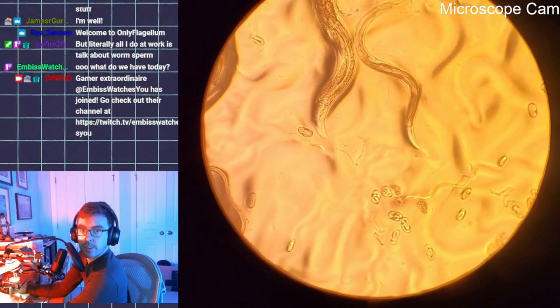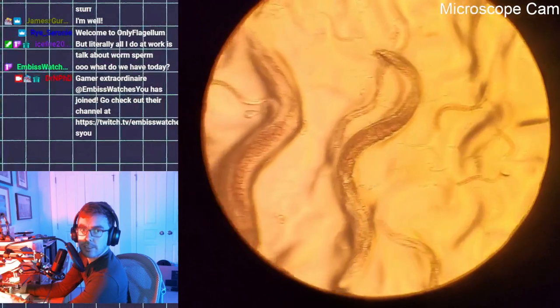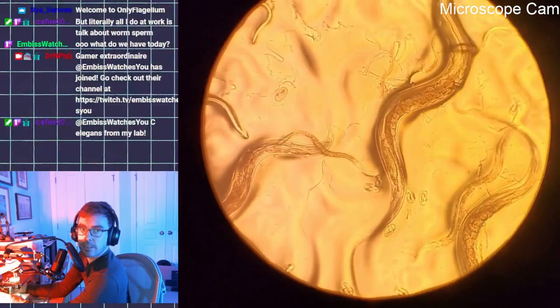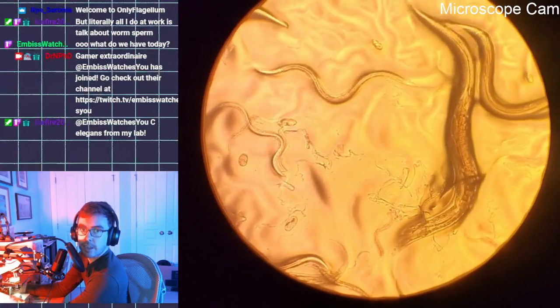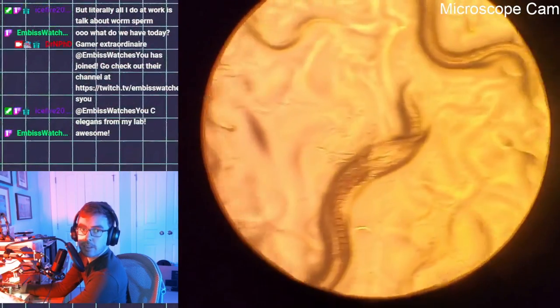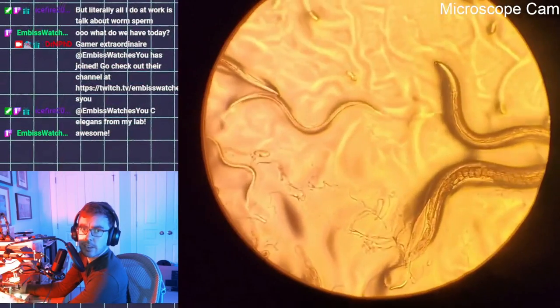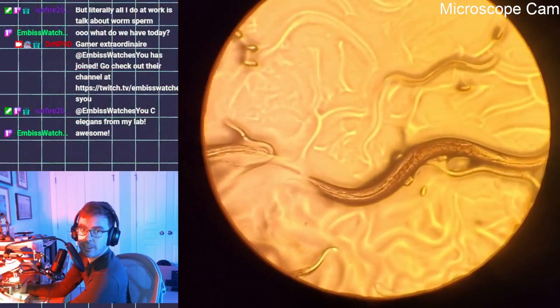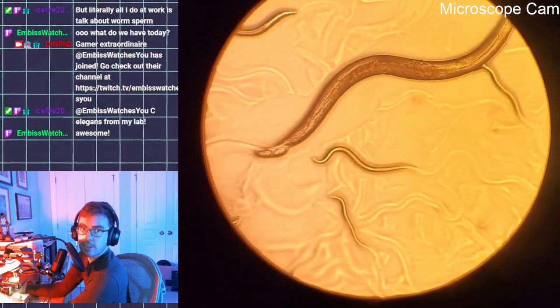Welcome. These are C. elegans. They are a nematode, the lab strain nematode. Yes, our mod Brian sent these to me via FedEx. So we're checking them out. I really want to get a couple of these under the slide, especially these right here, which you can even see the oocytes inside of them. Again, Brian, just tell me if I'm wrong. That's what the line of very large cells down the midsection are.